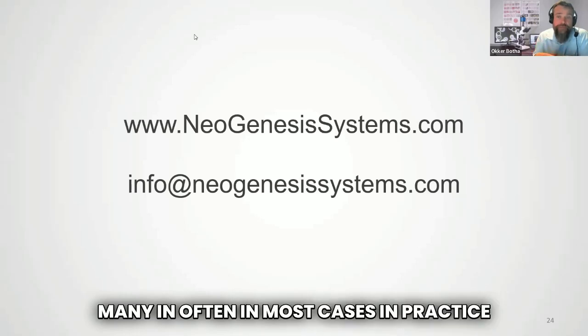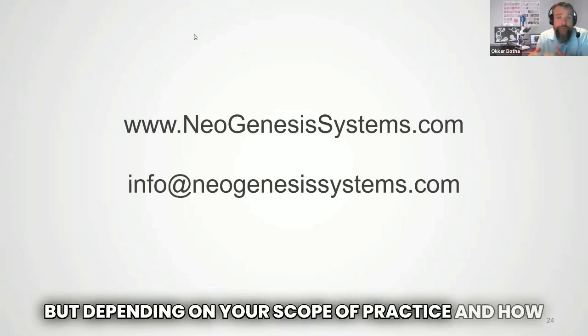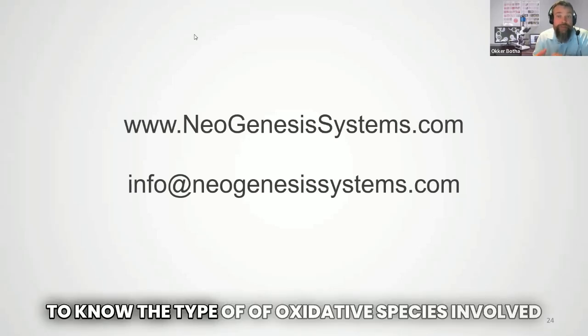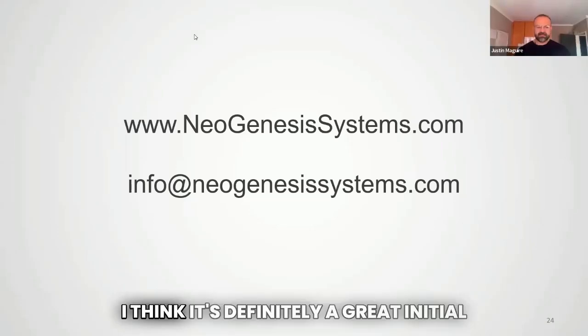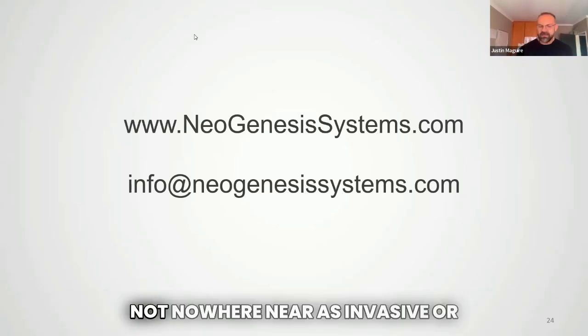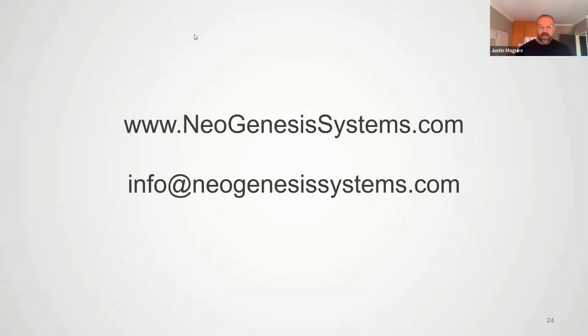Often in most cases in practice, there is no need for further tests. But depending on your scope of practice and how you work with your clients, you may need to do further tests to establish the type of oxidative species involved. Thank you, that's very clear. I think it's definitely a great initial diagnostic point, and also a great real-time follow-up diagnostic point. It's nowhere near as invasive or time-consuming or costly as a lot of the other diagnostics.